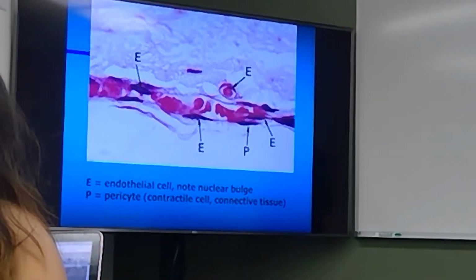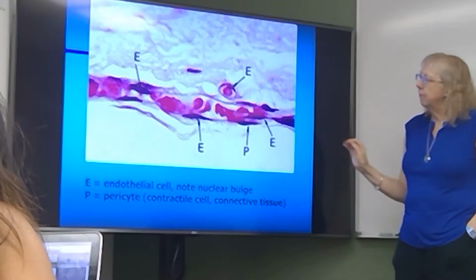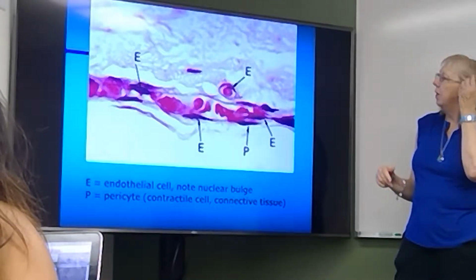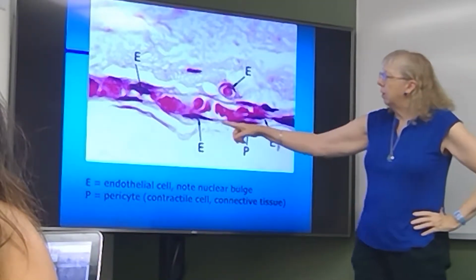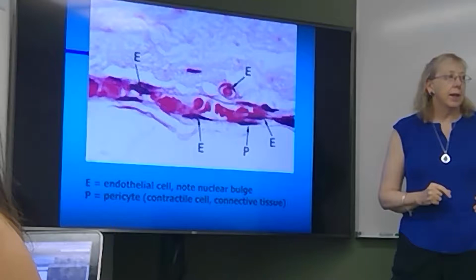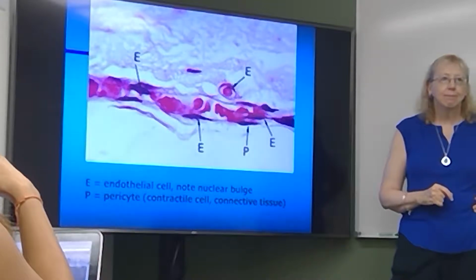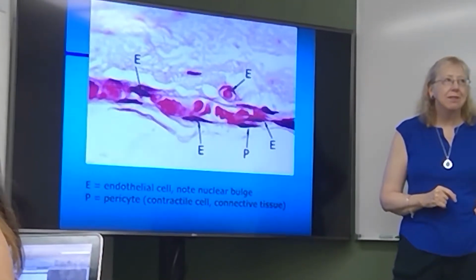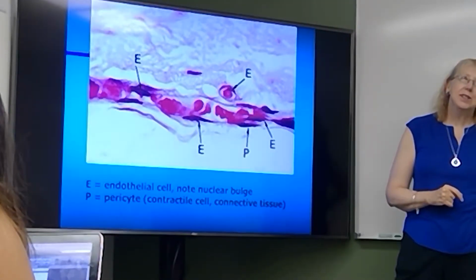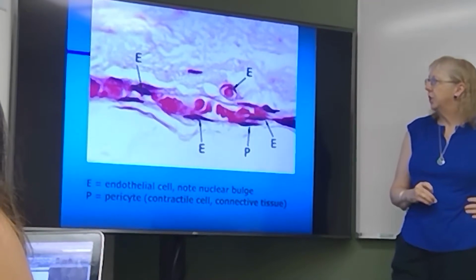So here's some examples. So here we have connective tissue, and this is a section through a blood vessel. When you blow it up this way, it's really pixelated, I guess. But anyway, what we're looking at here are the nuclei that are staining purple-blue. The dye that does this in our routine histological stains is called hematoxylin. So the emphasis that I'm giving that, you need to know that, but I want you to know that by the end of the semester. I find too many students don't remember. Hematoxylin is one of the dyes we'll be using to stain the tissues.